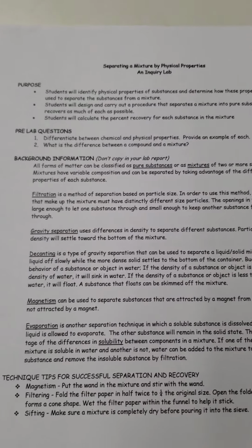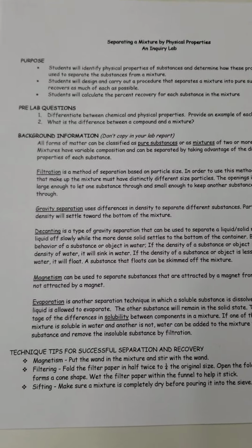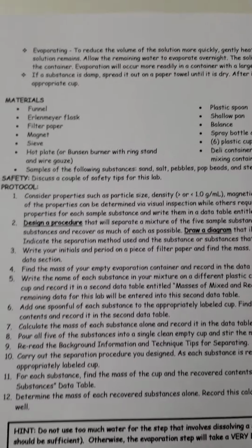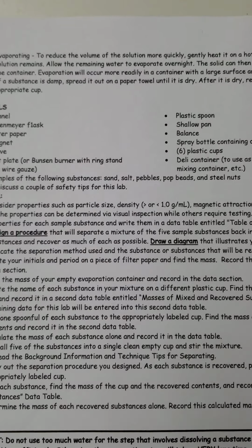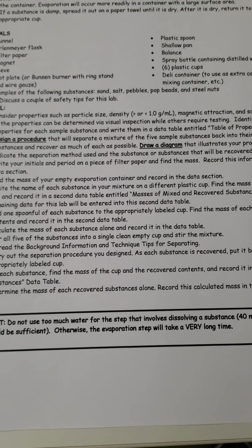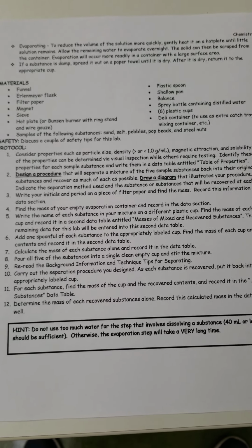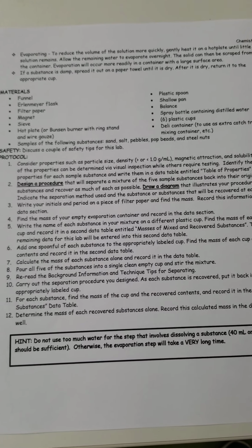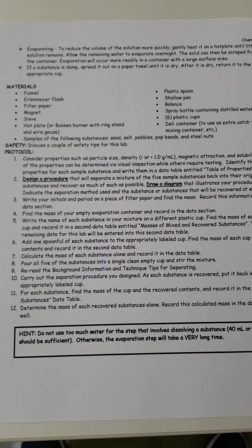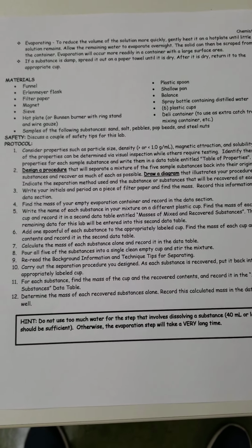Since I'm going to be conducting this lab, a lot of the information I can fill in as I'm going through it. On the second page, we have our list of materials, and I'll show you all of them. The one thing with regards to the protocol for this is that it's really a mixture of set steps in the beginning, and then you're supposed to have your own design and work through your own procedure.